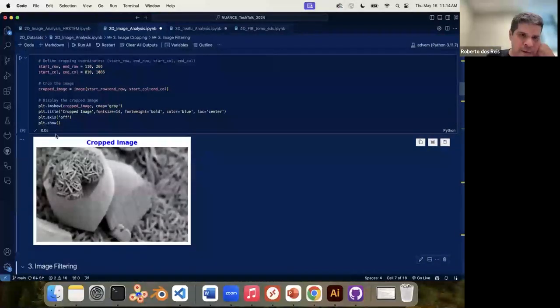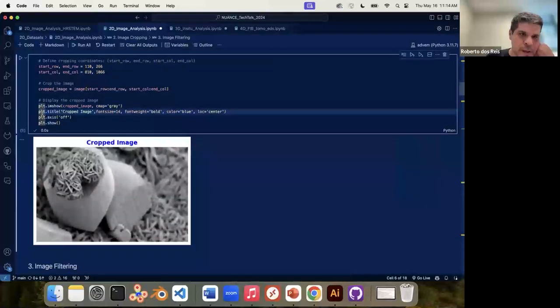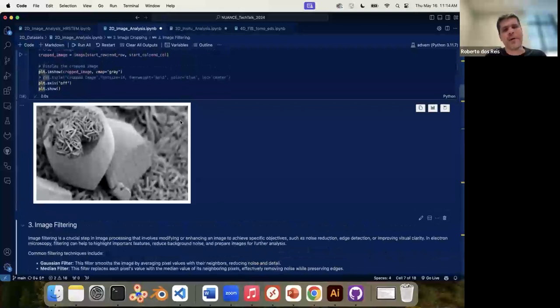Again, I added the title here. If you don't want to add that, just comment this off. Okay, for example, have this. This looks a little better, right?